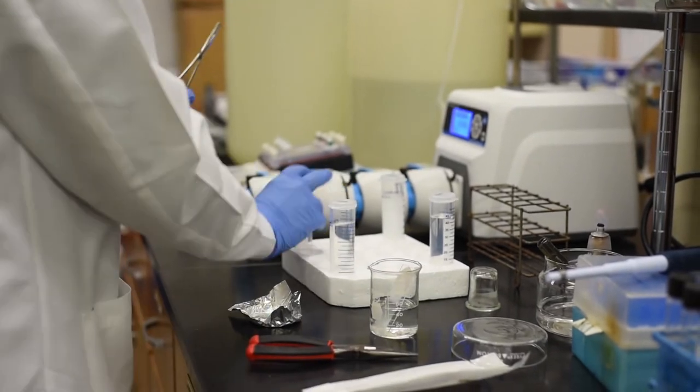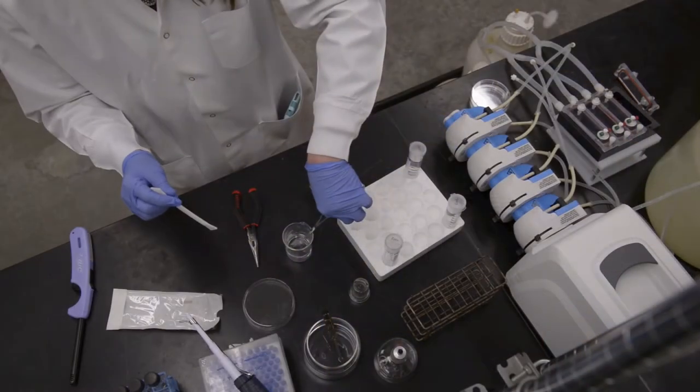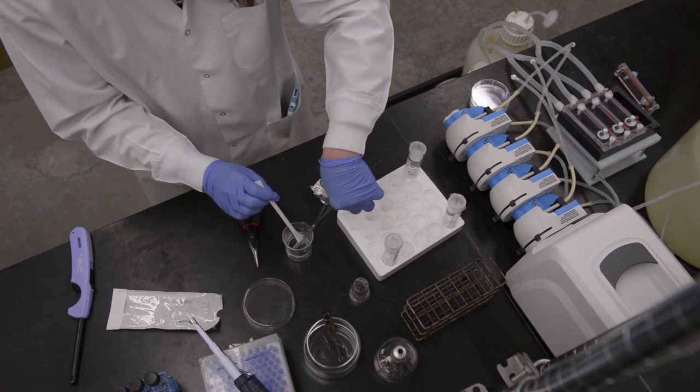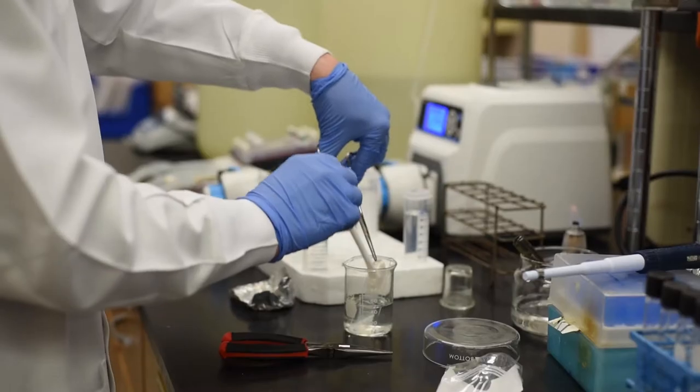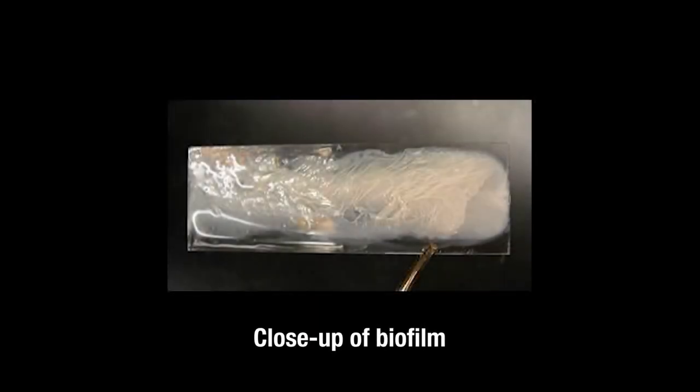To harvest the biofilm from the slide, place it in a beaker containing 45 milliliter sterile buffered dilution water. Use a sterile policeman spatula to scrape the biofilm from the surface into the liquid. Rinse the spatula in the liquid and repeat two to three more times.